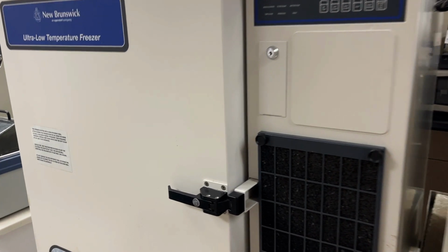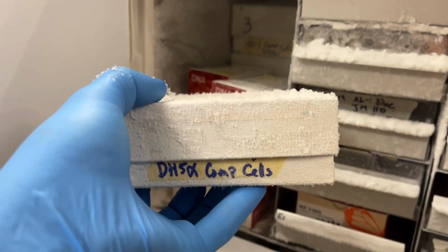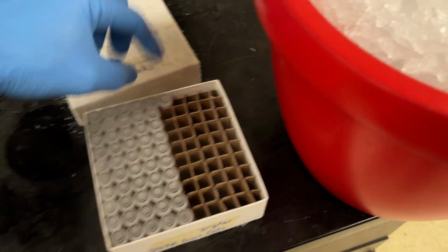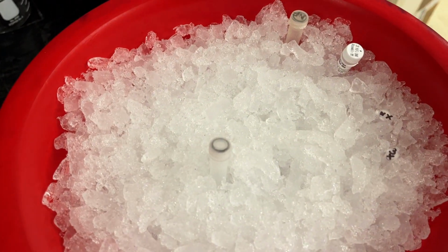Competent cells are very sensitive, so we keep them in our deep freezer. The strain that we're going to use for this example is called DH5 alpha, and whenever you handle competent cells, always keep them on ice as much as you can throughout the whole process.